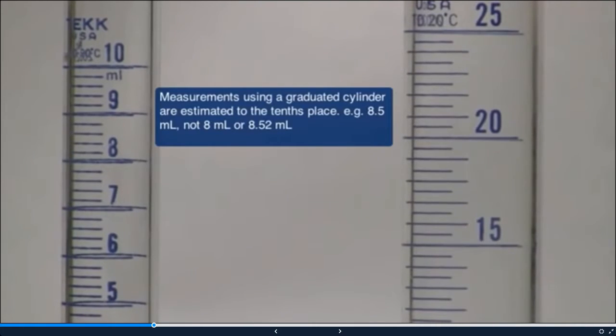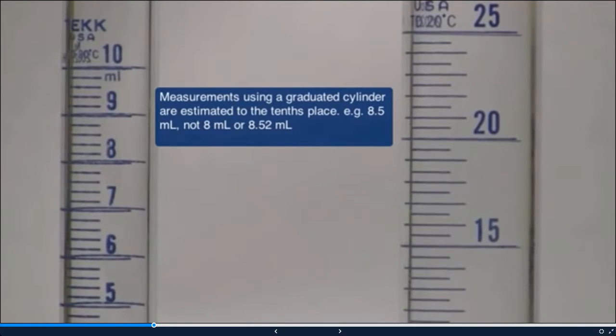When you take measurements, you want to take it to the tenth place. For example, 8.5 milliliters would be a good reading rather than just 8 milliliters or 8.52 milliliters. Let's try to take an accurate measurement of the two liquids in both graduated cylinders.